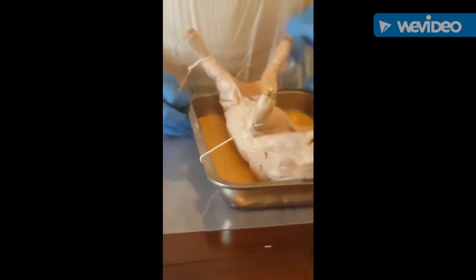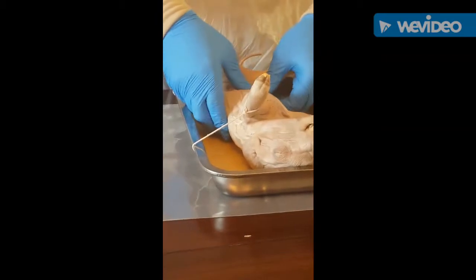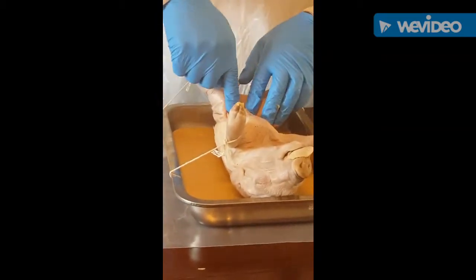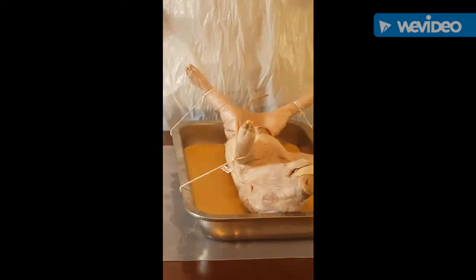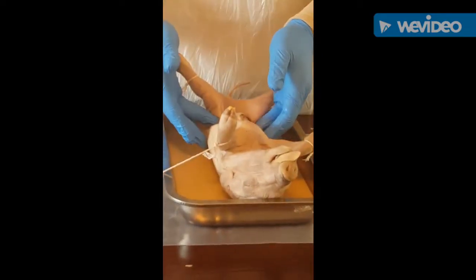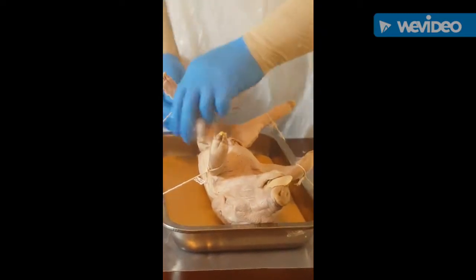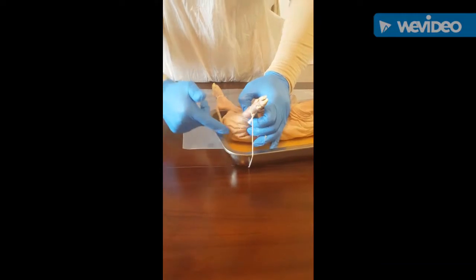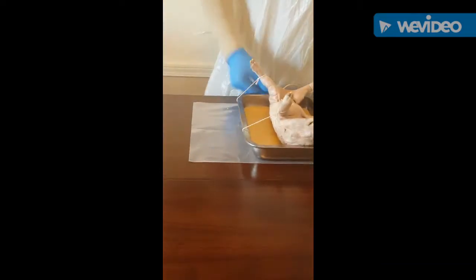That's going to be that center abs, that 8-pack that this pig does not have, but they have little nipples here. This is going to be that rectus abdominis. The transverse abdominis is going to be what I like to consider obliques when I'm trying to work that. So it's going to be the side abs that keeps that whole body stable. And the gluteus medius is going to be that top of the butt here, working into that thigh there.